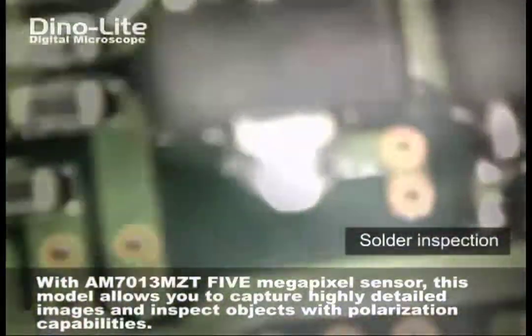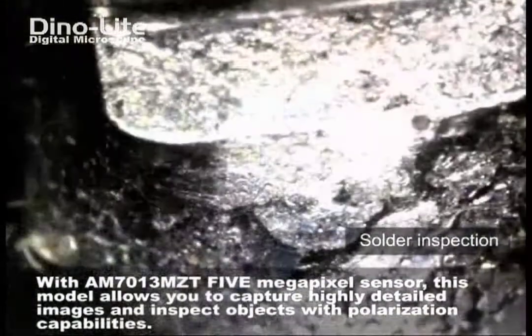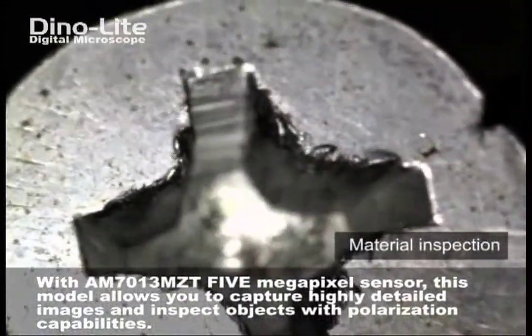This model is particularly great for inspecting highly reflective, polished, or metallic materials and finishes. These images here are being manually polarized by simply turning the dial found at the end of the unit.